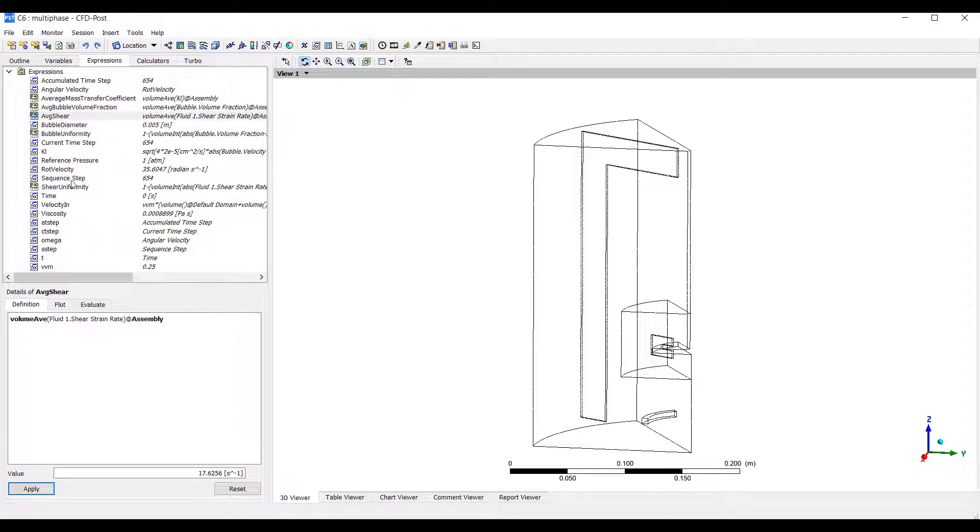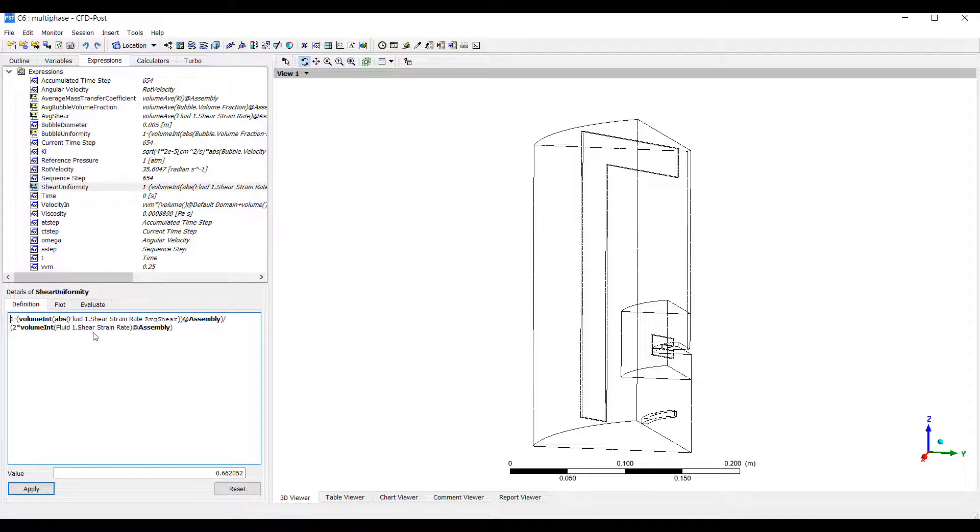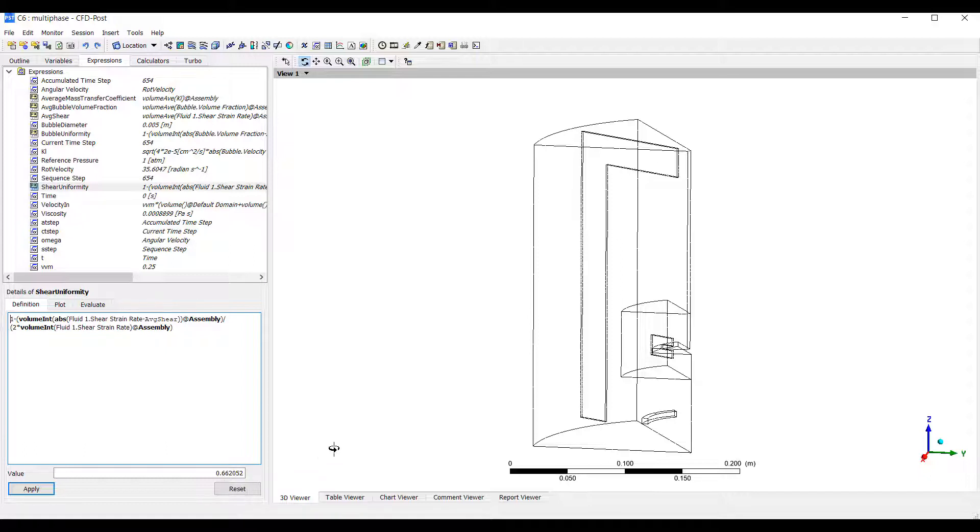Once we have the shear strain rate, we want to know what the shear uniformity is. We can write an expression that uses our average shear strain rate to calculate the uniformity. This is from 0 to 1, where 1 means it's perfectly uniform and 0 means it's not uniform at all. You can see we have a 0.6 value for our uniformity coefficient.